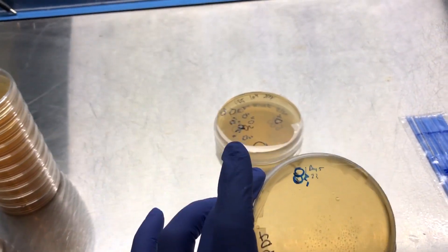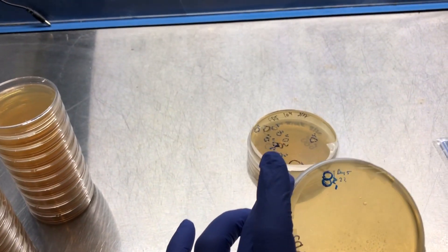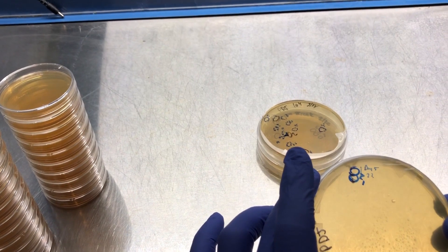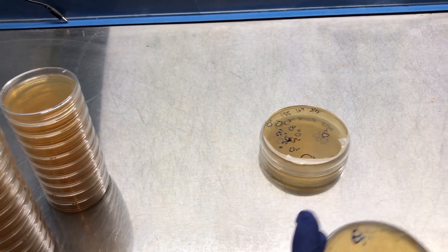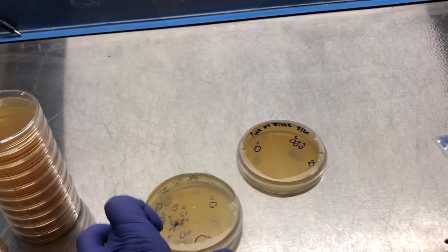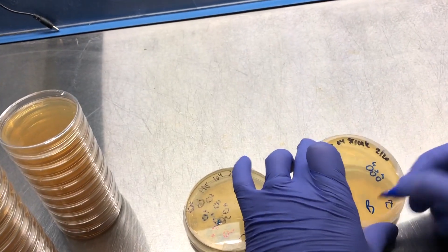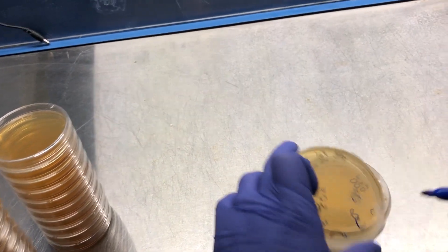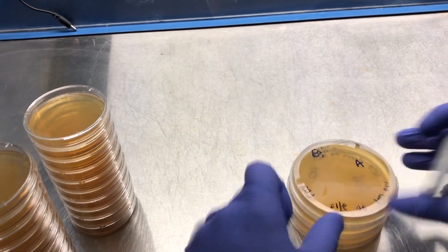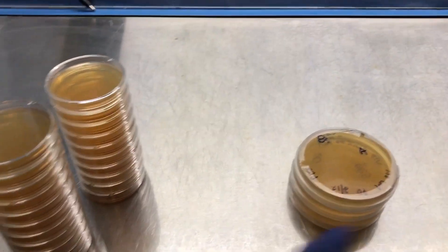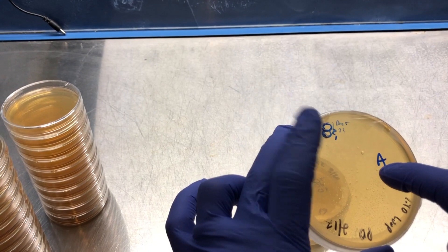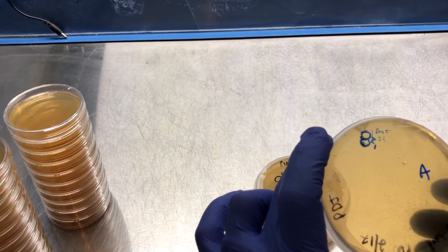And since they're a little bit smaller and clustered together, I'm going to use my sterile inoculation loops. So I'm going to label my plates A, B, and C according to cleanliness.